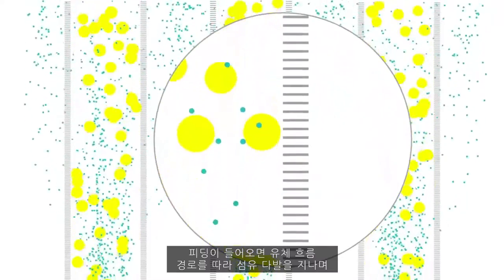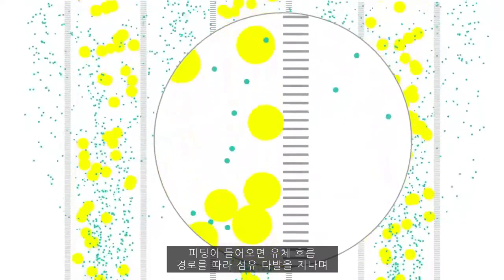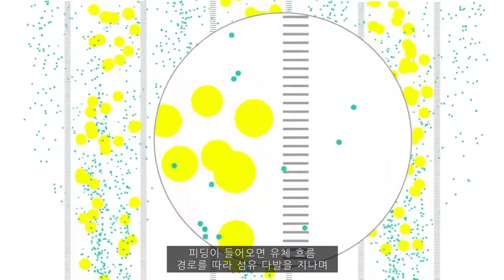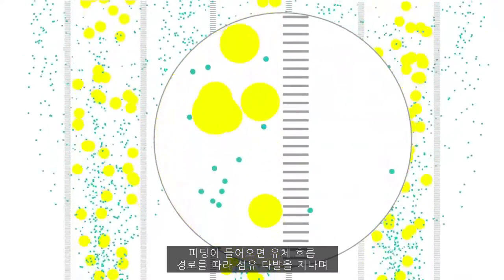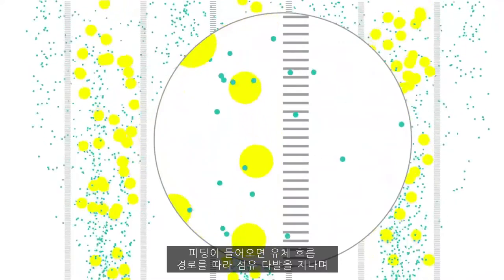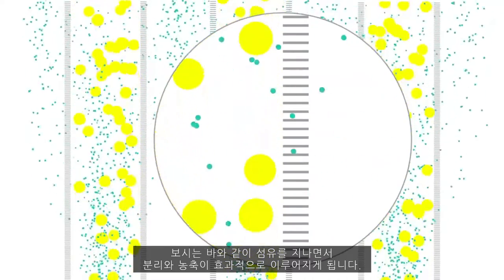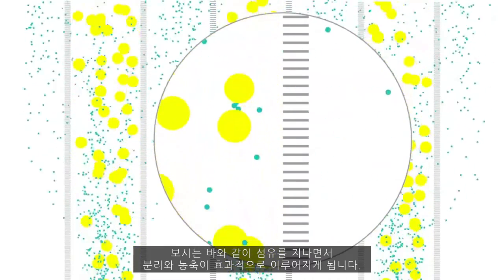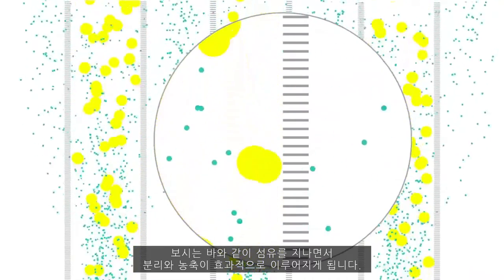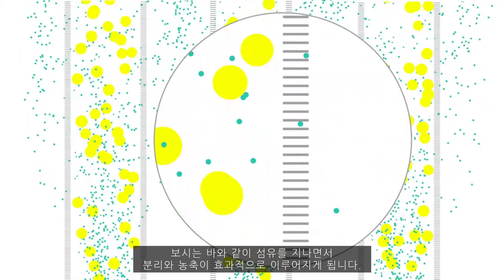As the feed stream enters the feed port, it passes through the fibers along a uniform flow path. Within each fiber, efficient separation and concentration of molecules occurs.